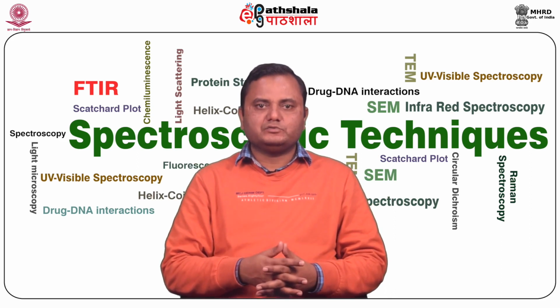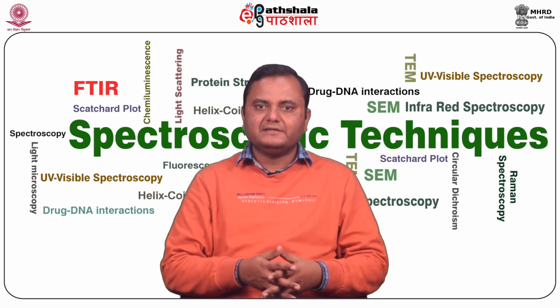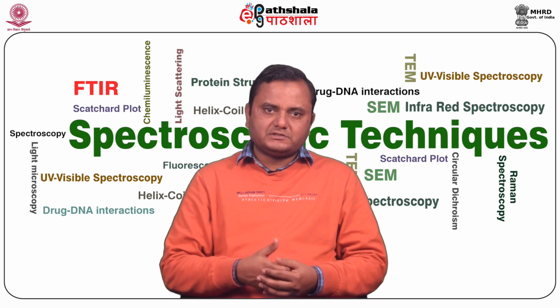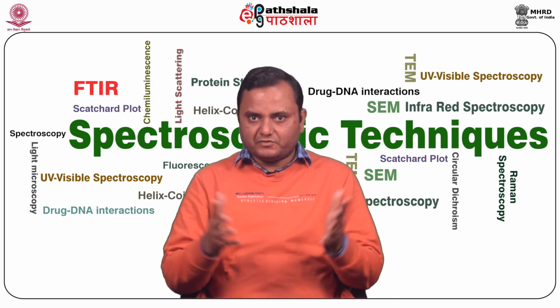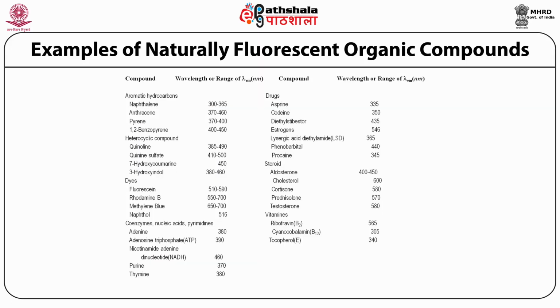Photomultiplier tubes serve as a detector to measure the intensity of the light, because the light quantity is very low. Of course, the photomultiplier tube helps you to multiply the light and give you a proper amount of signal, and the output current of the photomultiplier is fed to some measuring device that indicates the extent of fluorescence in the form of a signal or a fluorescence spectrum. We give the example of some naturally occurring fluorescent organic compounds, such as naphthalene, which has an emission range of 300 to 365, and anthracene, 370 to 460. Like that, you can see the emission range of all the fluorescent organic compounds.